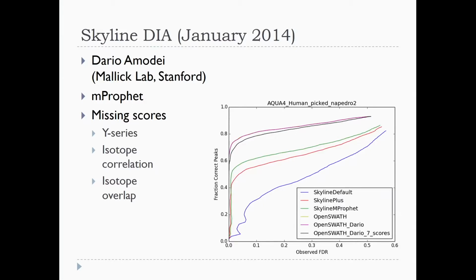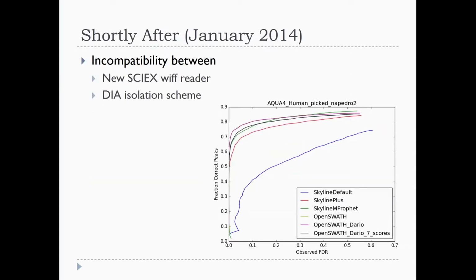What I start with is the top scoring thing that OpenSWATH scores incredibly well and Skyline doesn't get right. And what we found was there's no peak. Skyline's chromatograms had no peak. OpenSWATH is saying there is a beautiful peak right here, and we had no peak.